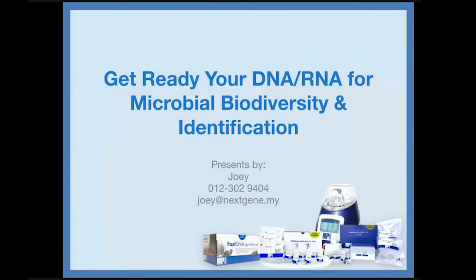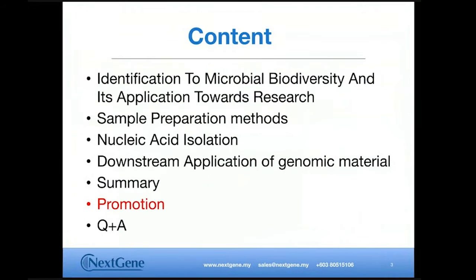So without any delay, let's start with our webinar today on Get Ready Your DNA RNA for Microbial Biodiversity and Identification. Here's a little context on today's webinar. I will separate it into two parts. The first part will be on identification of microbial biodiversity and its application towards research, followed by the second part where I will share with everyone a series of ways to obtain genomic material, starting with the sample preparation method, followed by nucleic acid isolation, and finally the downstream application of genomic materials. Then I will have a short summary on the topics mentioned above, and then we will have a very special promotion for everyone who has joined us to the very end of the day. So quickly share the link with your friends now, and then we will have the Q&A session as our wrap up.